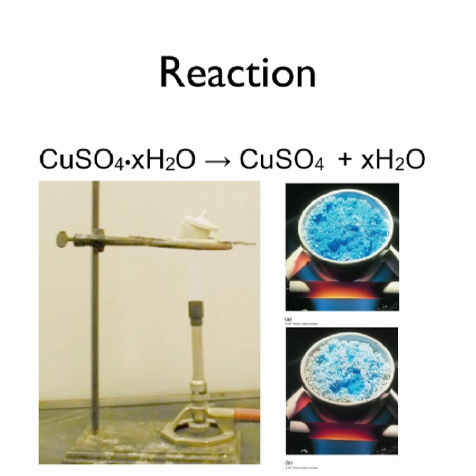The color of the sample will gradually change from blue to white as the water of hydration is driven out of the crucible. Then we will turn off the burner, cover the crucible, and allow the sample to cool for about 10 minutes. When the crucible is cool enough to handle safely, we will measure and record the mass of the crucible, cover, and contents. We will continue heating the crucible a second time with the contents for about 5 more minutes, then allow it to cool and record its mass in our report sheet.